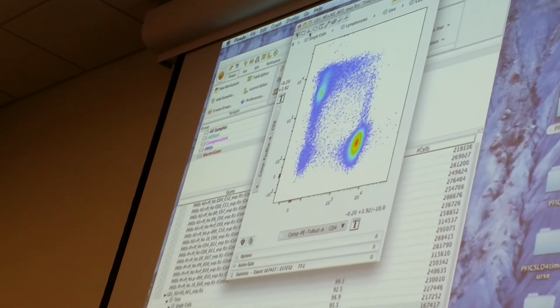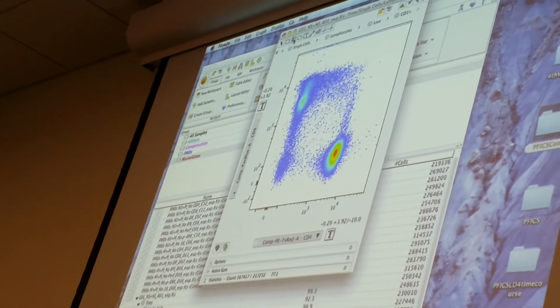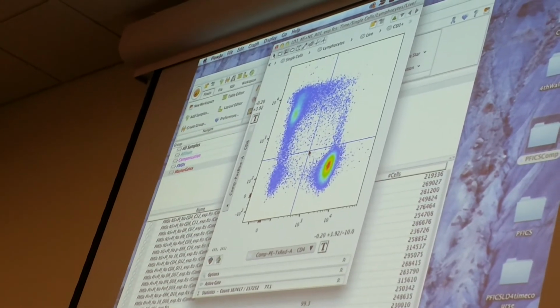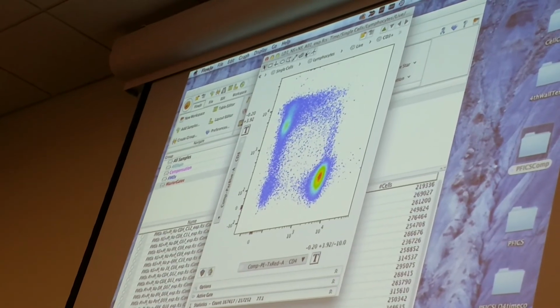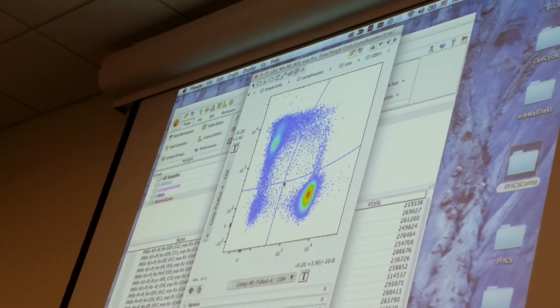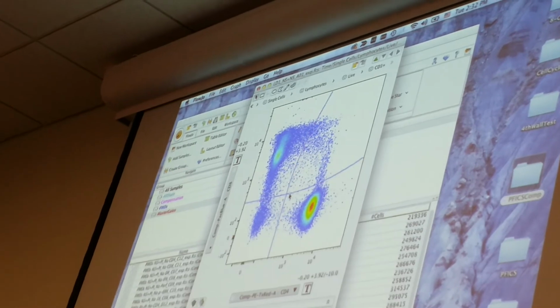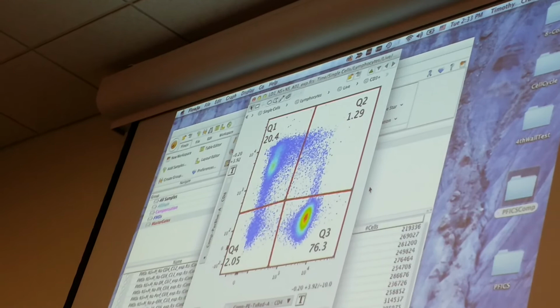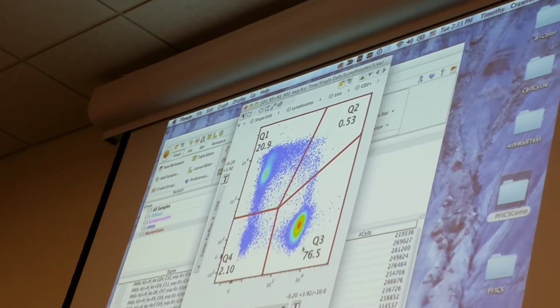This is a great distribution for using quadrant tools. In version 10, there are 3 different quadrant tools. One is the classic straight quads, right? Which you have also on the Mac. But I also have what's called a curly quad, which actually takes the spreading and compensation spillover into account mathematically. So I like those these days. Fun to play with. And then I have spider quads, where you set the center vertex and then you can change the way they meet the x and y axes.